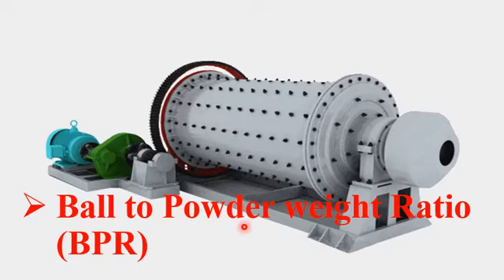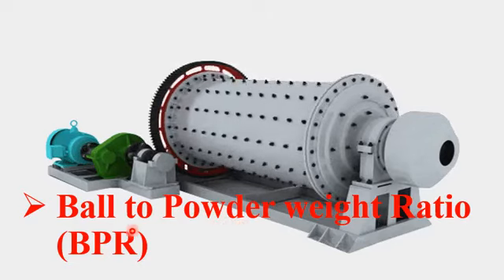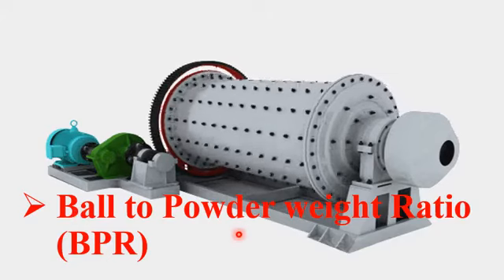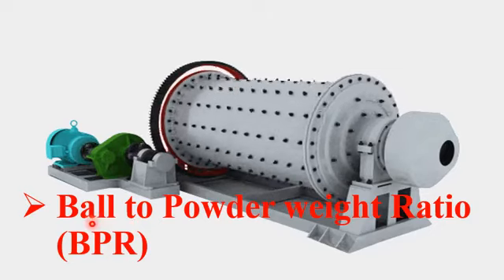So student, regarding the ball to powder ratio, if the number of balls is more than the amount of powder, then there is a possibility of overlapping of the balls, which may cause impurity in the powder.